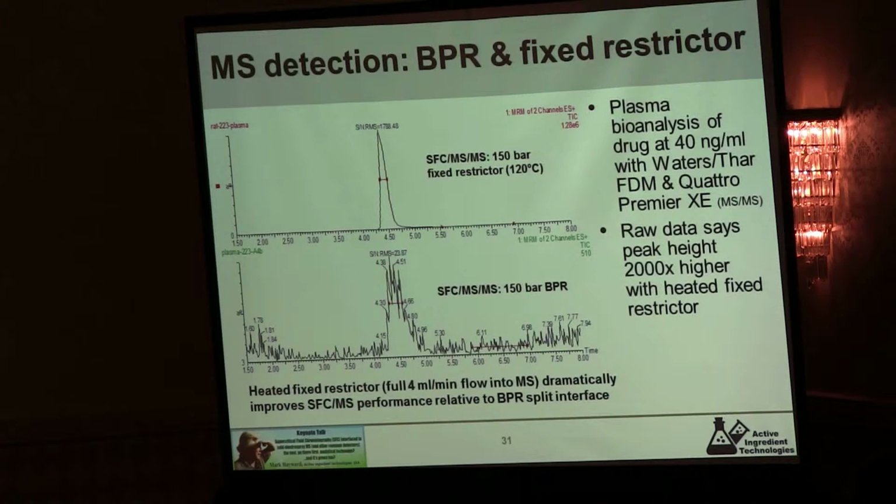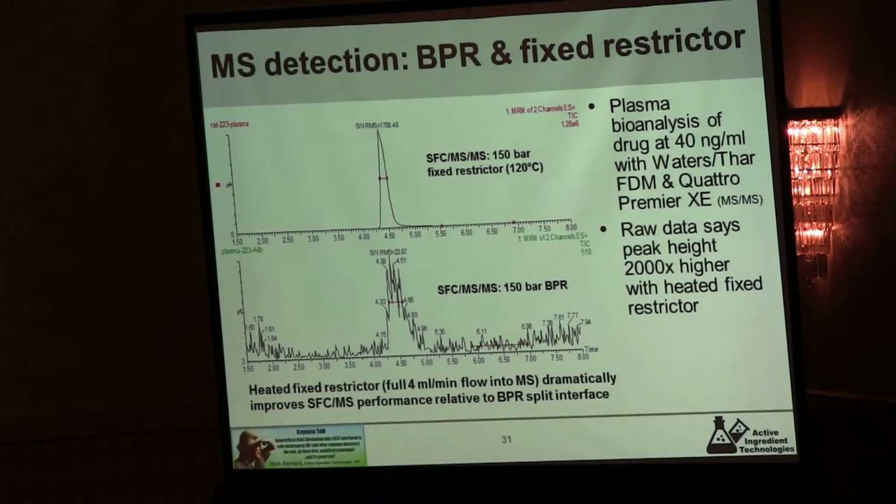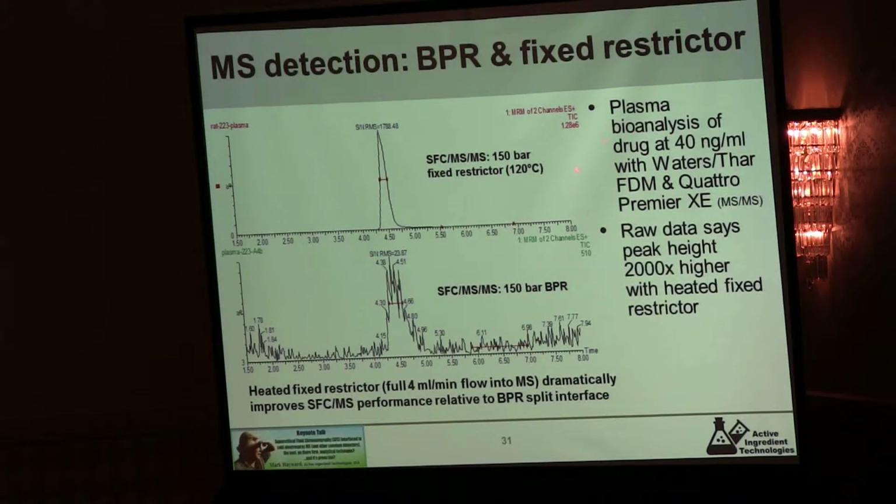And then, of course, with mass spec, first we compared the past with the new interface. In the past, sure, we could do mass spec, we could get signal. Wasn't a lot of it, not as near what we would hope for. Now this is a fairly challenging assay. We're doing plasma bioanalysis, but it's not the separation that's the challenge. It's really just having the sample enter the ion source of the mass spec under the proper conditions. So once we tried our approach out, the signal went through the roof.